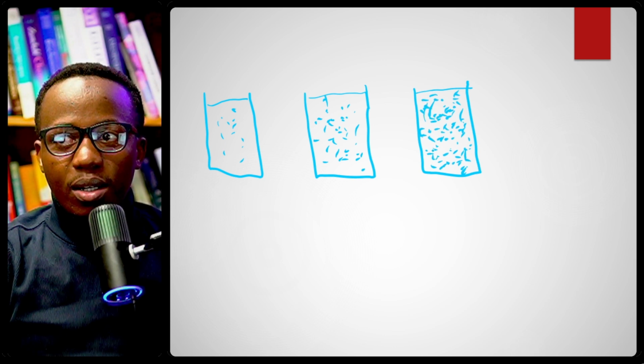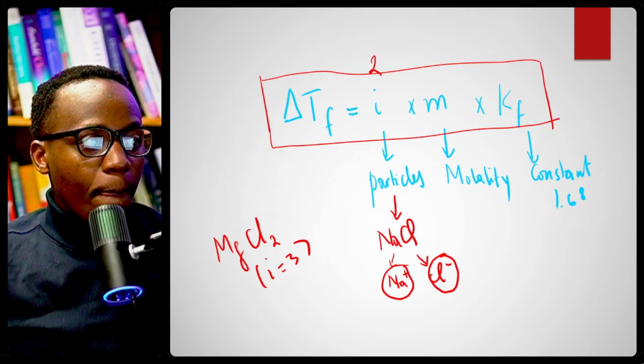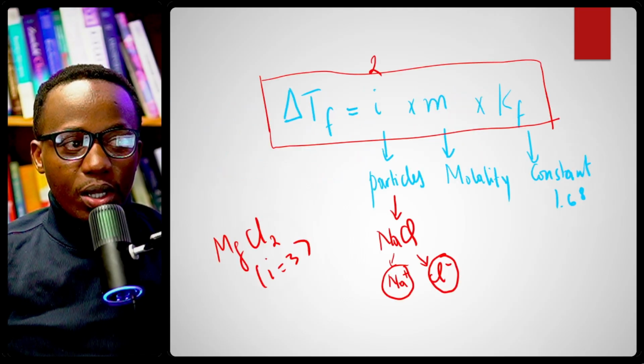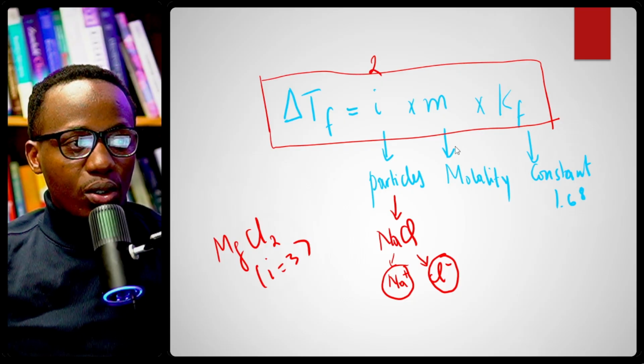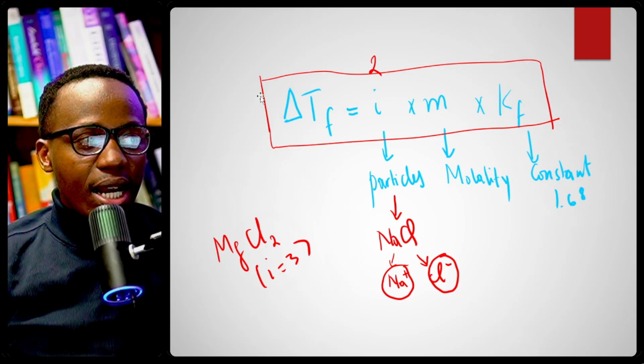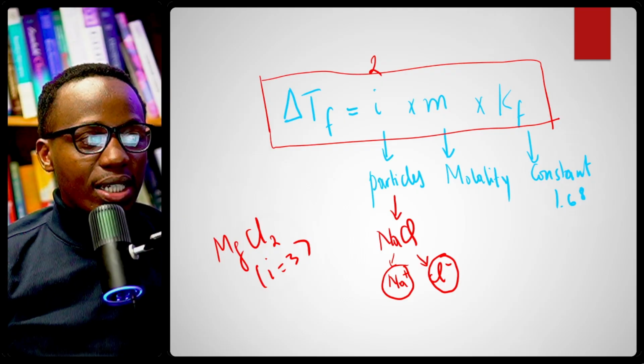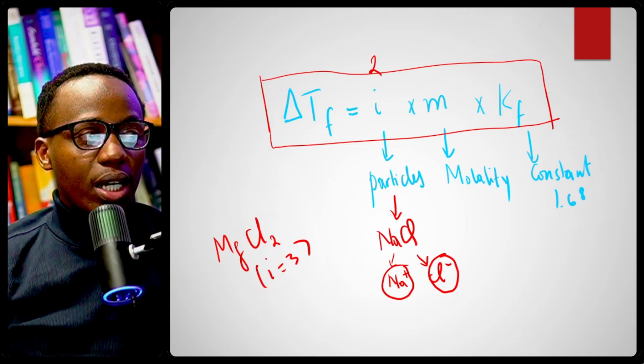And guess what? Based on this formula right here, the salt concentration, as you increase the concentration, the change in freezing point should increase.